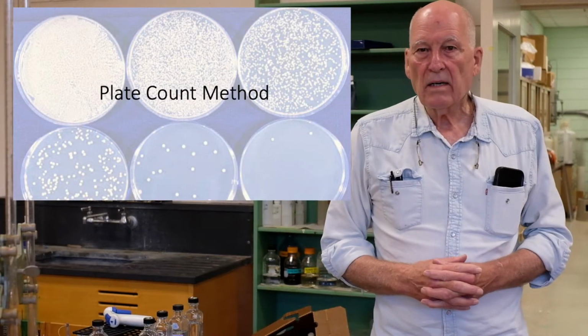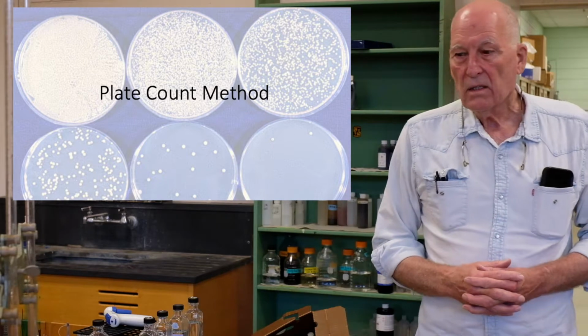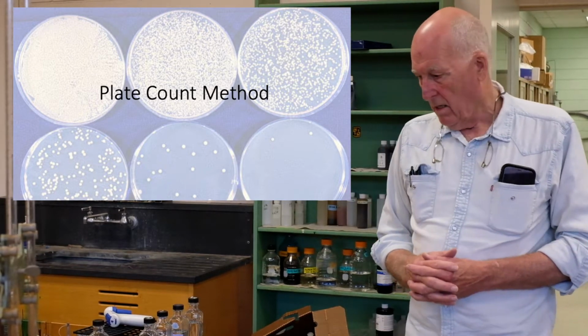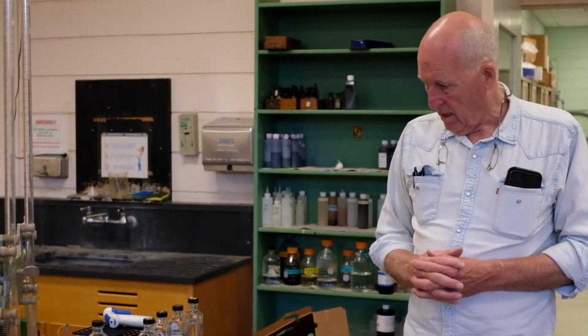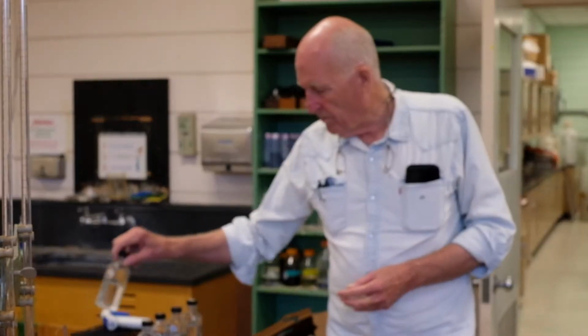So this is one of our technique videos. What we're going to be doing today is doing a plate count of all the various organisms that are found in our product.